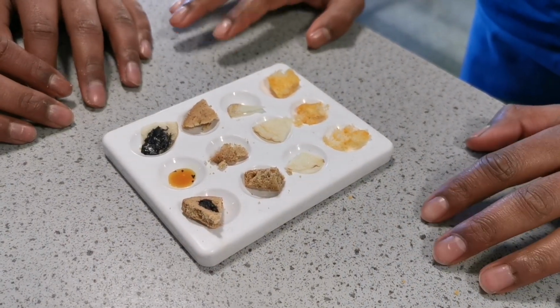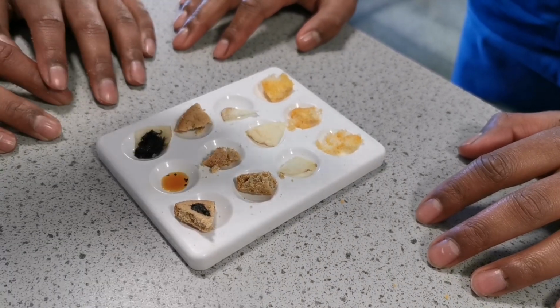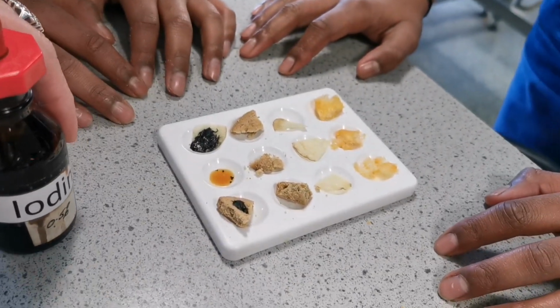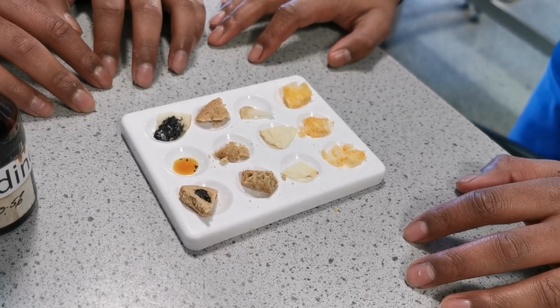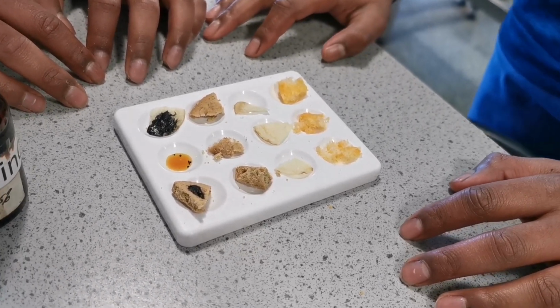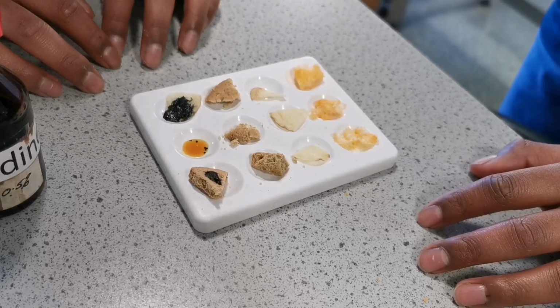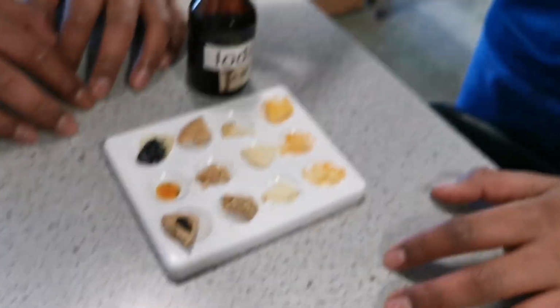Okay, so we've got two helpers here today, and they are testing Wotsits, Walker's Crisps and Digestives. They are going to be doing the iodine test on this. Obviously you guys already know that this is going to go from brown to a purple black if there is a positive test. The boys reckon it's going to be the digestive. You think Wotsits. Okay, so you're saying digestive.